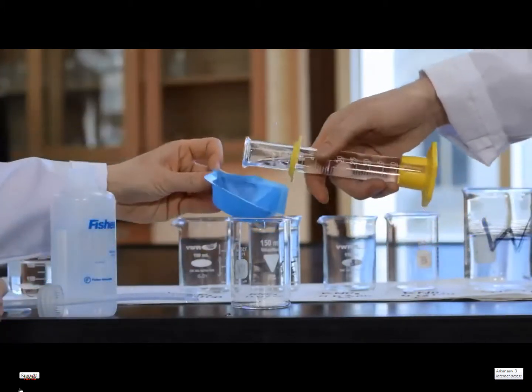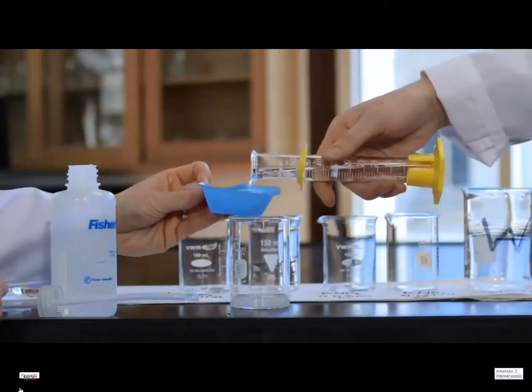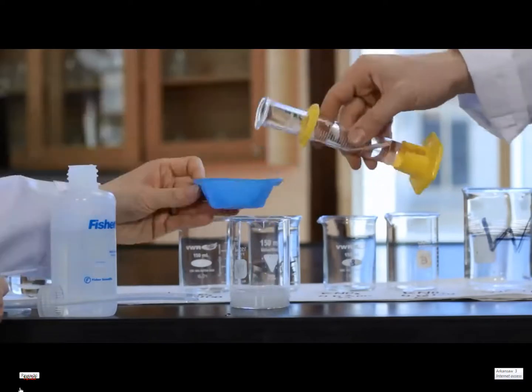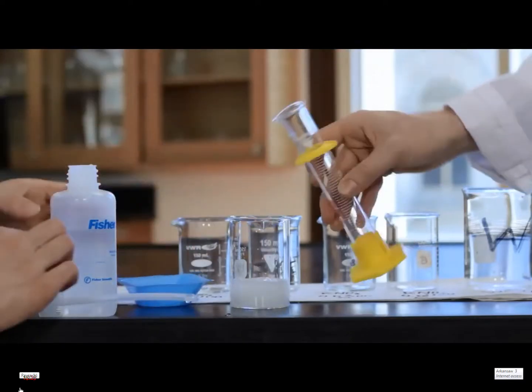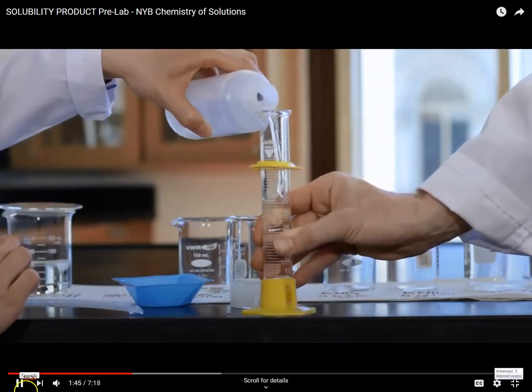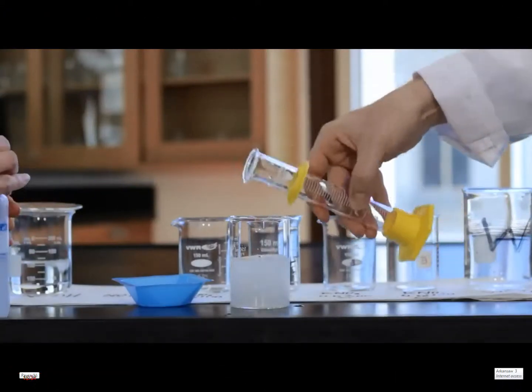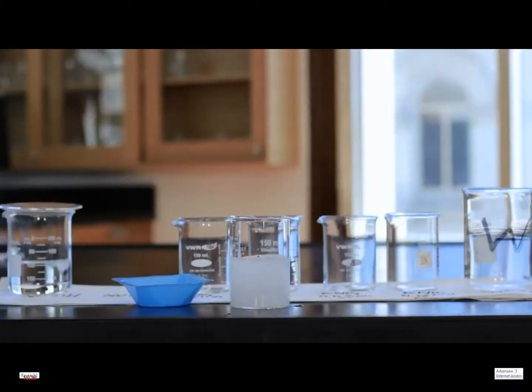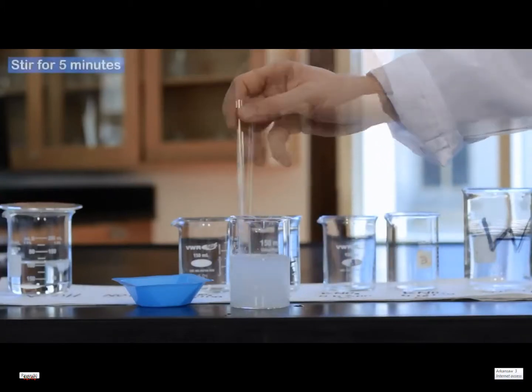Add approximately 100 milliliters of distilled water to the beaker and stir the solution vigorously for 5 minutes with a glass stirring rod.